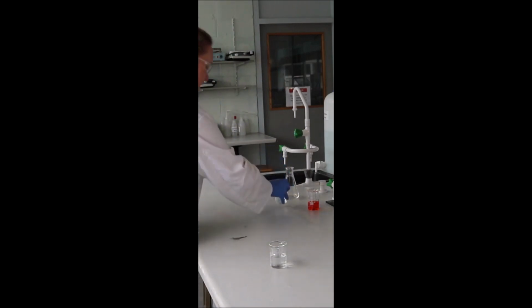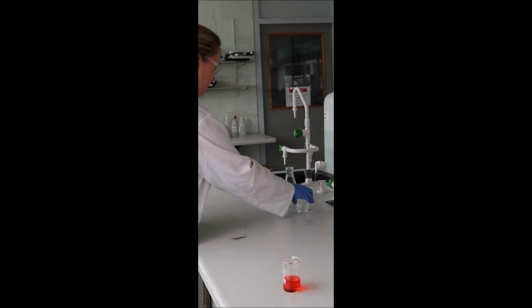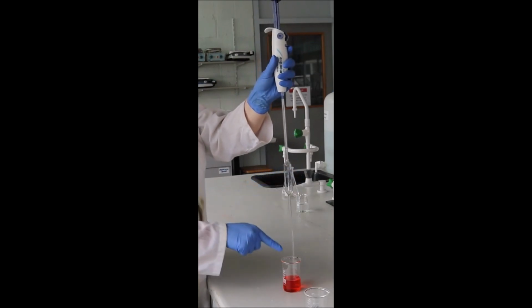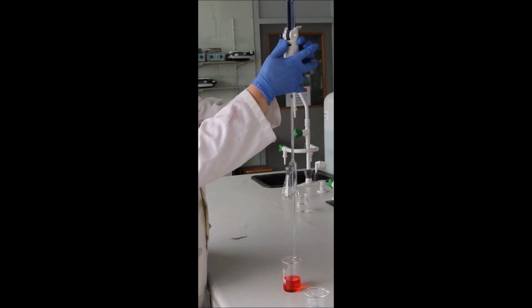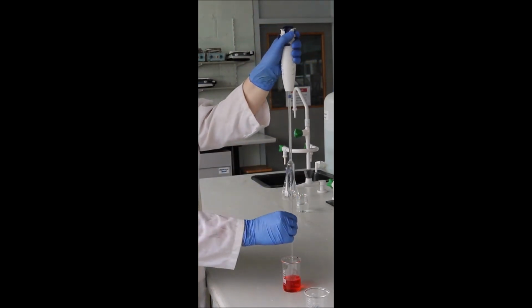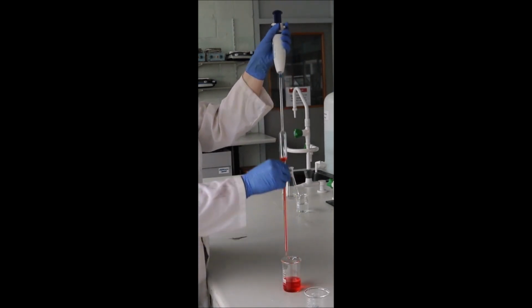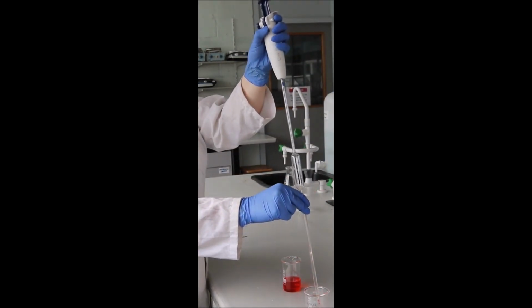Now that I've cleaned my glassware, I'm ready to pipette my actual solution. It's good practice to rinse the pipette with a small amount of the solution that it's going to contain. Here I'll depress the plunger and I can about half fill my pipette as I did before so that I can rinse it with the solution it's about to contain. Again, I gently rotate my pipette and I rinse it into my waste beaker.